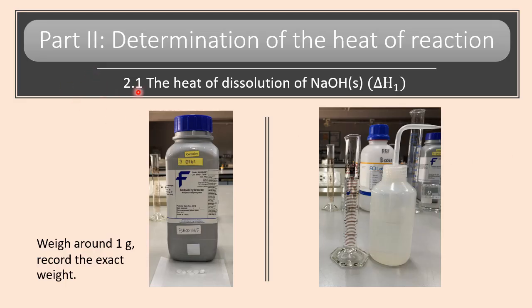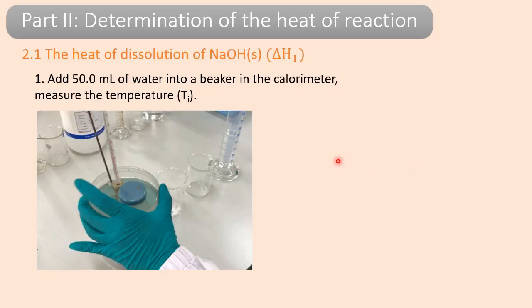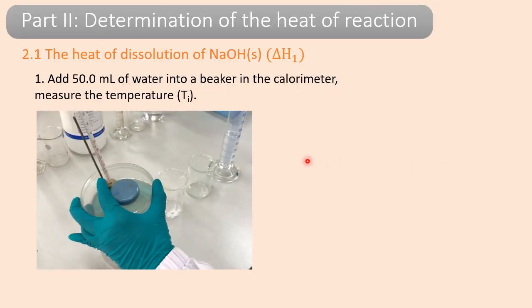Part two point one. We are going to find out the heat of dissolution of sodium hydroxide in solid form, or delta H1. So we need solid sodium hydroxide. We have to weigh it around one gram, then record the exact weight, and we need some water. Here is how to do the experiment.